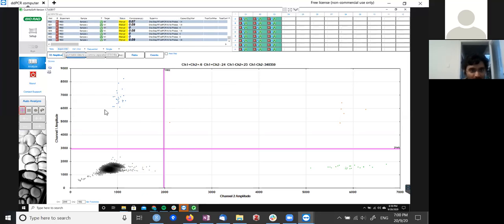So how do you know where to place the threshold? Currently we are just eyeballing it, but the goal is to have a big cluster in the third quadrant and clusters in the first, second, and fourth. These three quadrants should have clusters of points. You don't want to set a threshold that cuts through any of these clusters, especially the large black one.